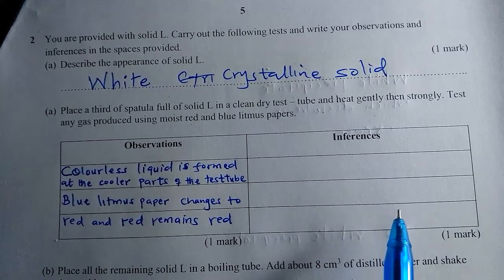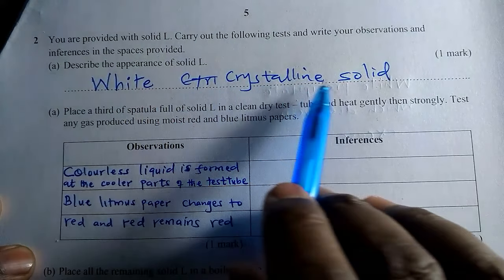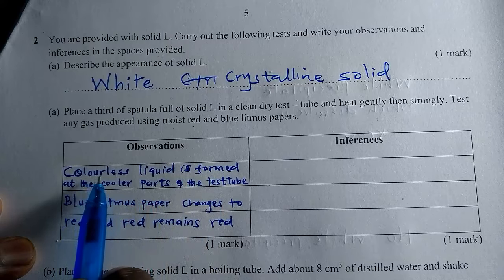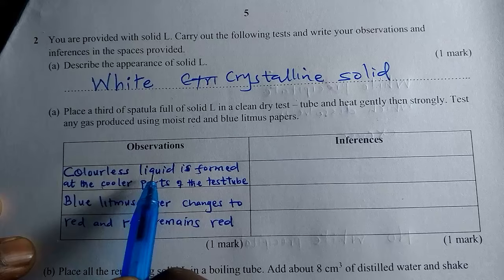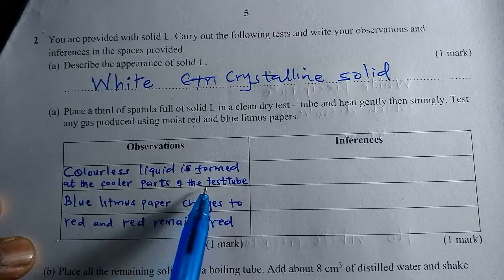So the first thing you expect, if this solid contains water of crystallization, then you will observe that at the mouth of the test tube there are some droplets of water, but you don't tell us it is water. Who told you it is water? So the correct way of saying that, you say a colorless liquid is formed at the cooler parts of the test tube, or droplets of a colorless liquid is formed at the mouth of the test tube, right?